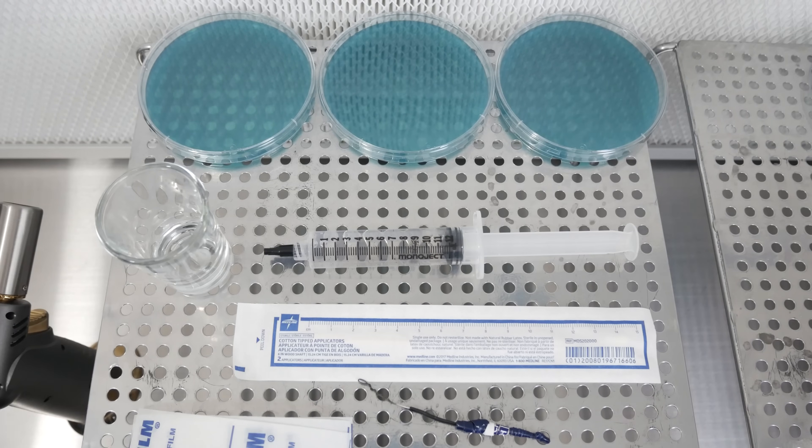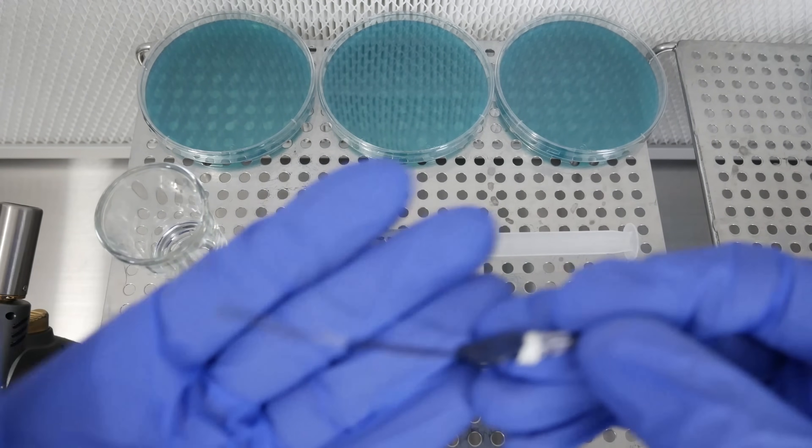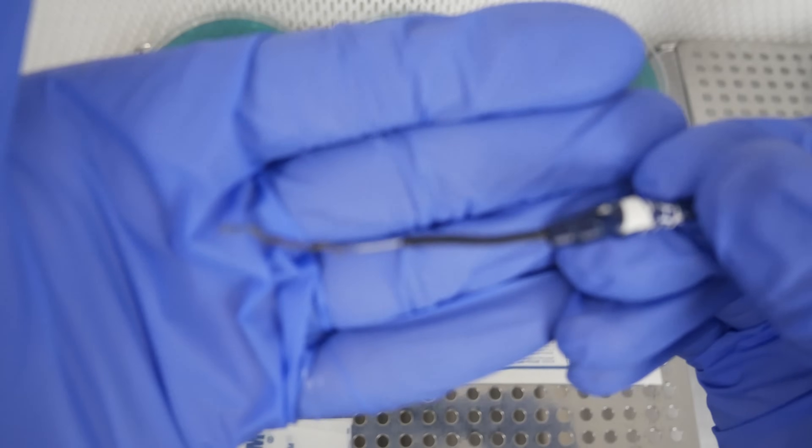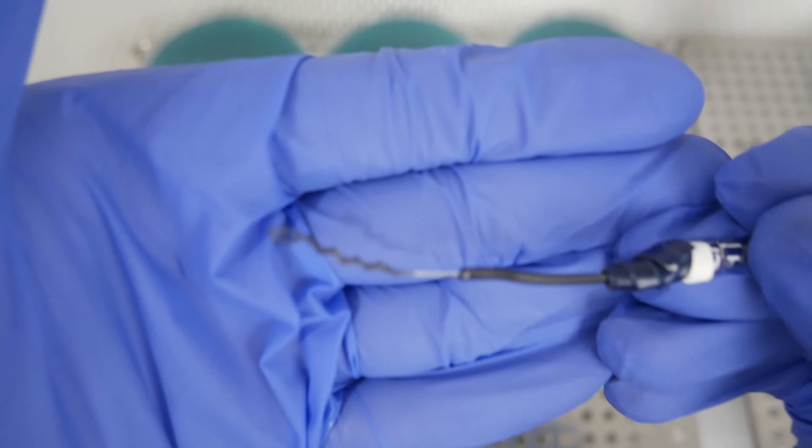One of the tools that I'm going to be using to inoculate is called the inoculation loop. You can purchase these for yourself under lab supply materials, but I went ahead and made my own out of a cheap twist tie.